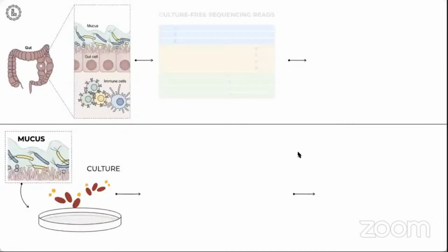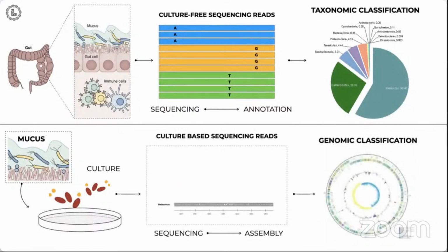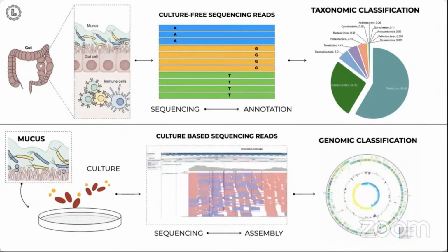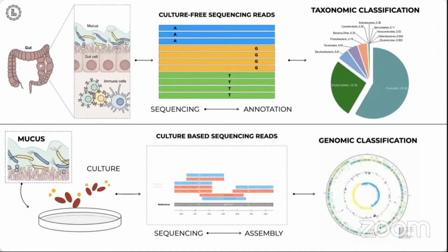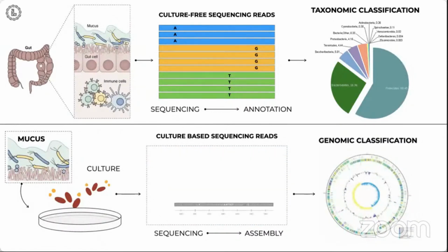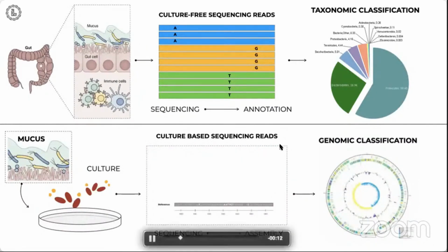So this sequencing can be applied to any culture-free environmental population, as well as to any detailed extraction of microorganisms that can be characterized with or without culturing in labs. Often, in order to gain a complete understanding of these selected few microorganisms, these techniques are combined. First, a detailed or exploratory metagenomics approach is applied to some culture-free sample, and then these selected few microorganisms are grown in laboratory culture to explore and verify the hypotheses that we generate from the metagenomic sequencing or these culture-free sequencing techniques.